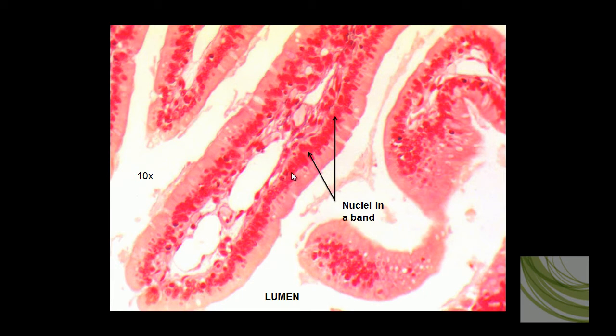We see all the individual little simple columnar cells. We can also see a few goblet cells mixed in here. Looks like there's one goblet cell that's expelling its mucus.